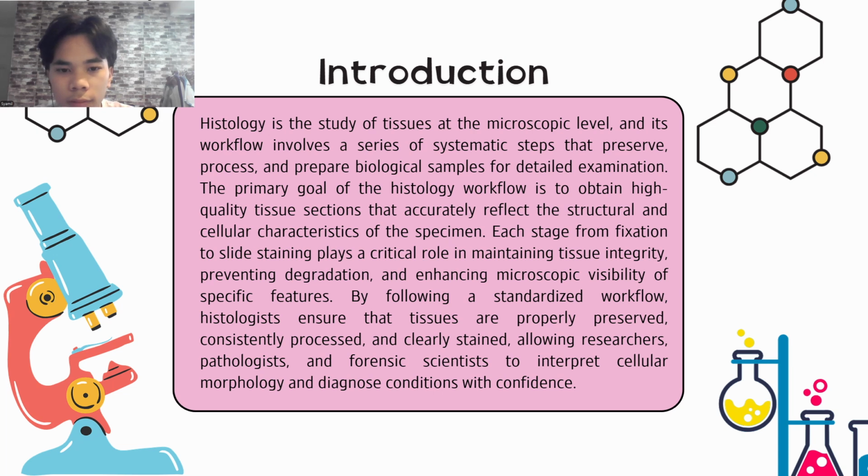So first of all, the introduction. What is histology? The histology workflow represents a standardized multi-step process in pathology laboratories designed to transform fresh tissue specimens into thin, stained sections suitable for microscopic examination and diagnostic interpretation. It begins with specimen accessioning and gross examination.